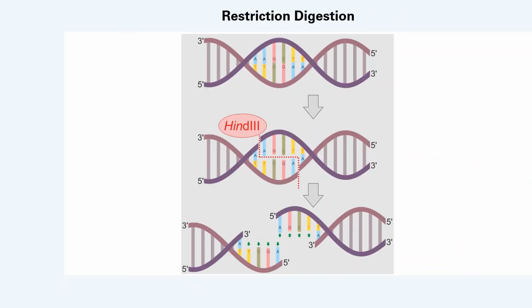All right, so we talked a little bit about DNA. Let's talk about restriction digestion and how an enzyme cuts it. So this is a sample DNA, and you have these complementary nucleotides binding. The restriction enzyme shown in this picture is HindIII. It's just an example, but this restriction enzyme will recognize a sequence of DNA, and most of the time these sequences are palindrome sequences.